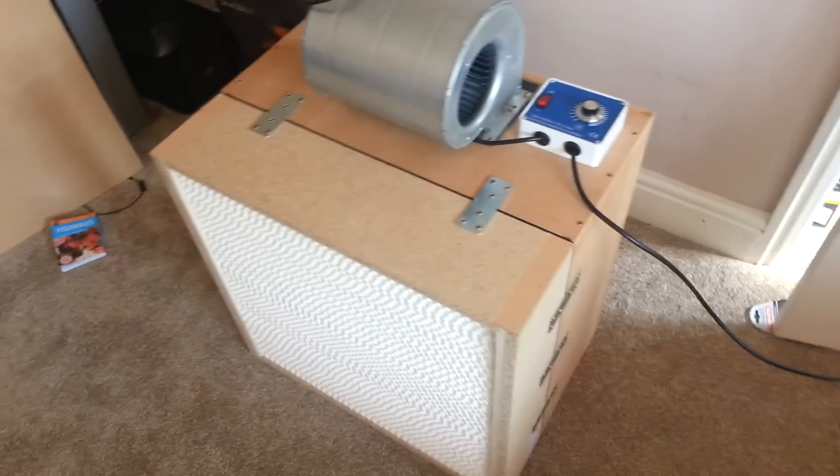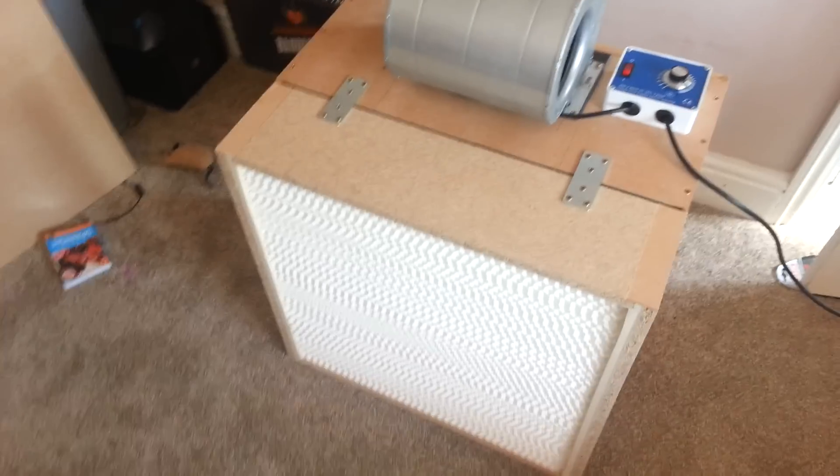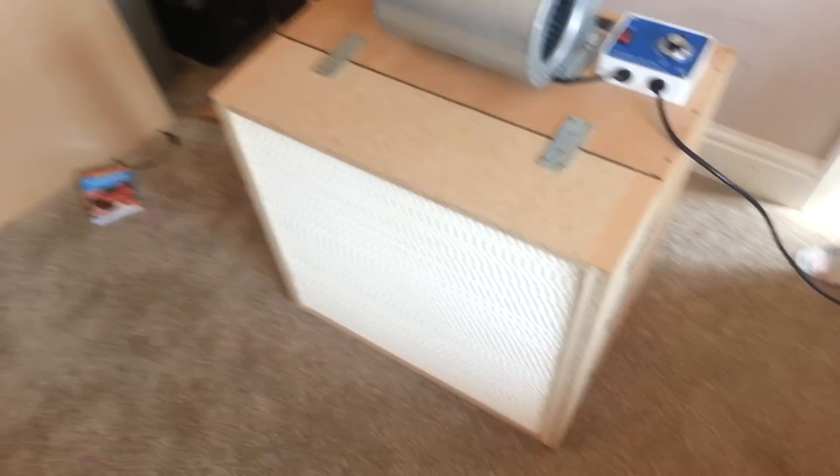Hi there, I'm just going to talk you through my laminar flow cabinet — it's more like a laminar flow wall. What you use this for is for sterile work.